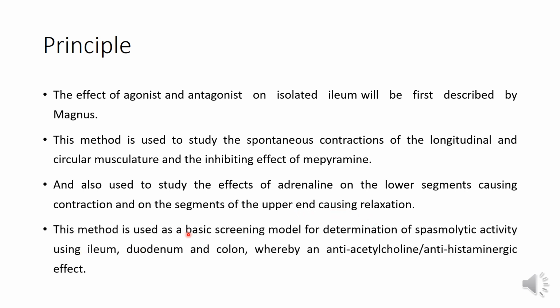This method is used as a basic screening model for the determination of spasmolytic activity using ileum, duodenum and colon, whereby an anti-acetylcholine or antihistaminergic effect.